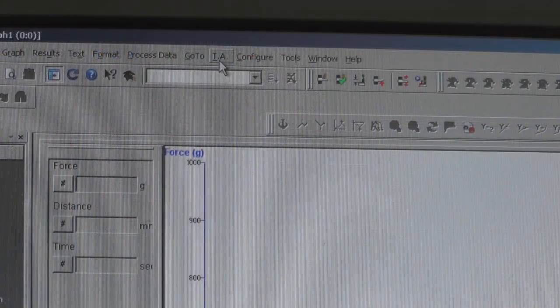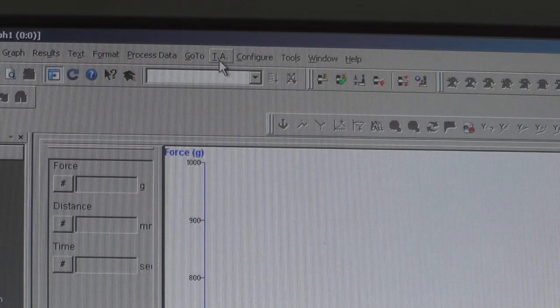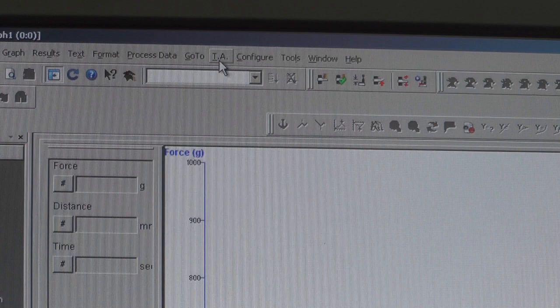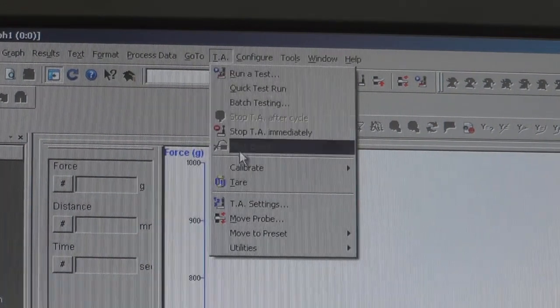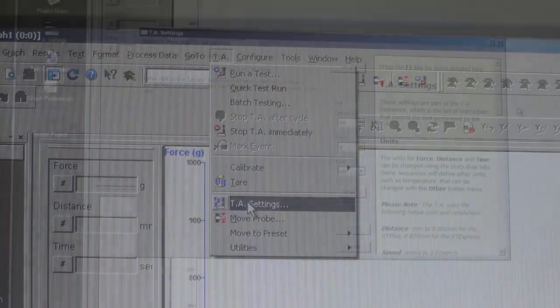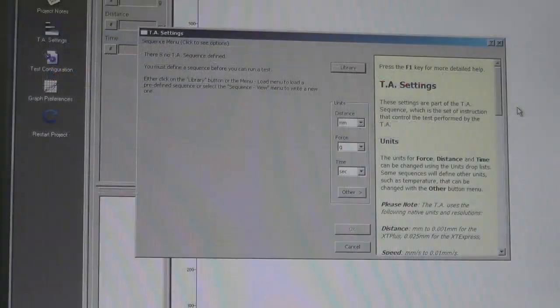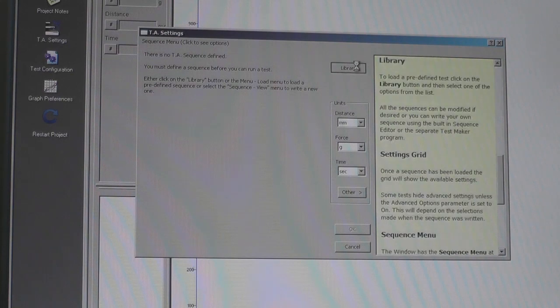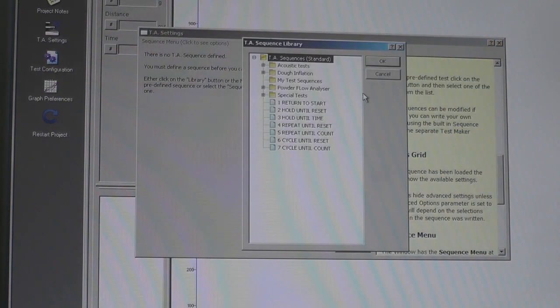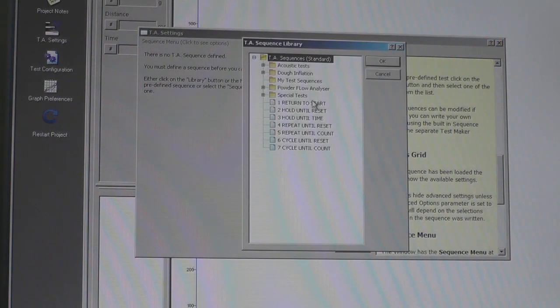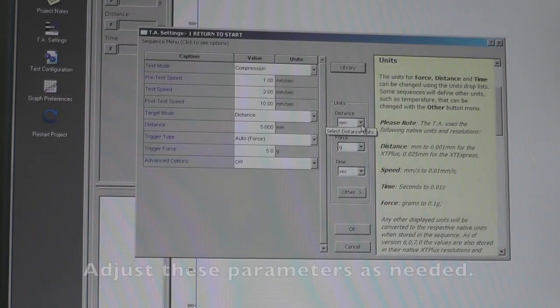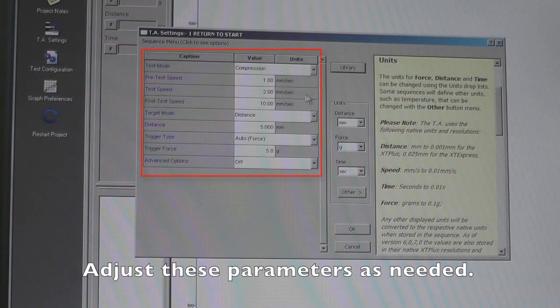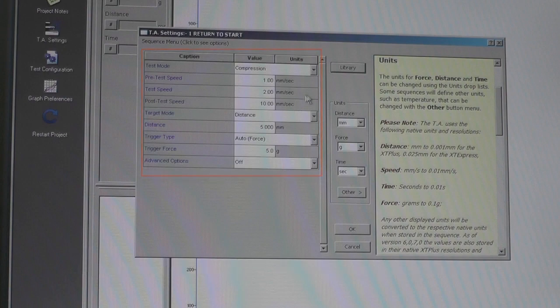To adjust the settings of the Texture Analyzer, go to the TA tab and select TA Settings. On the Settings screen, click on Library and choose a TA sequence appropriate for your experiment. Here we will use Return to Start. Click OK. Then adjust TA settings as you desire. Click OK.